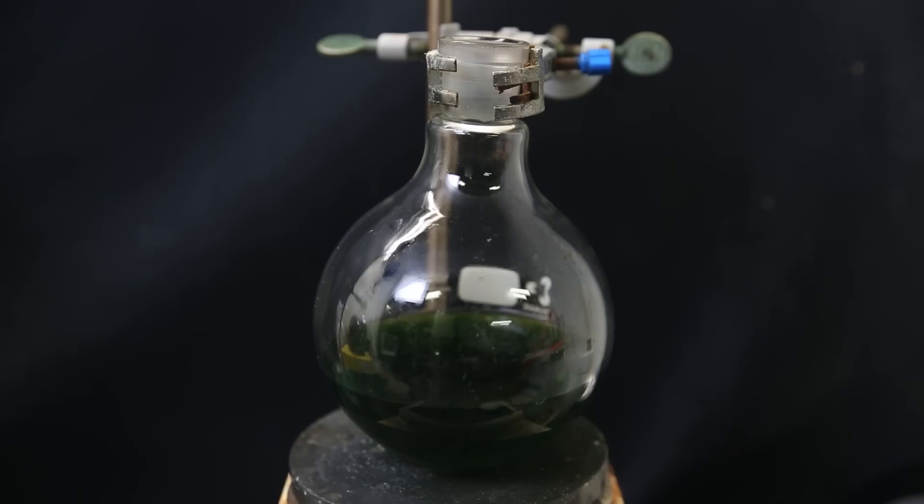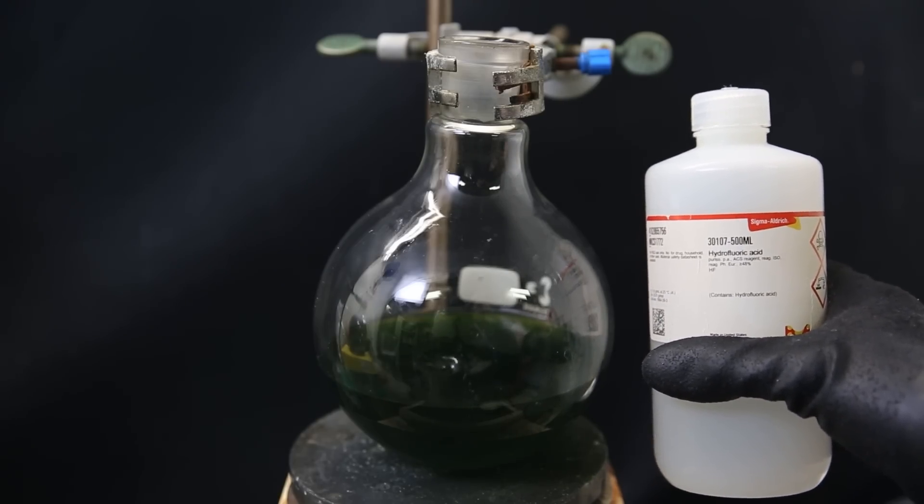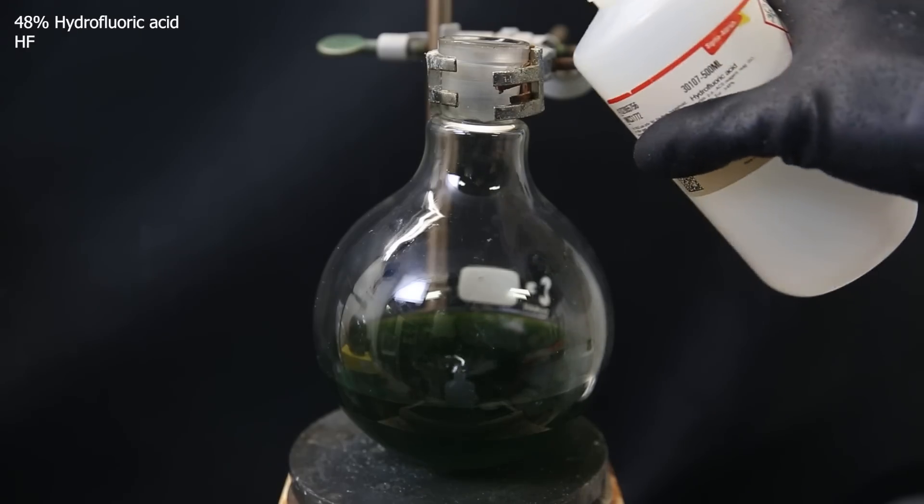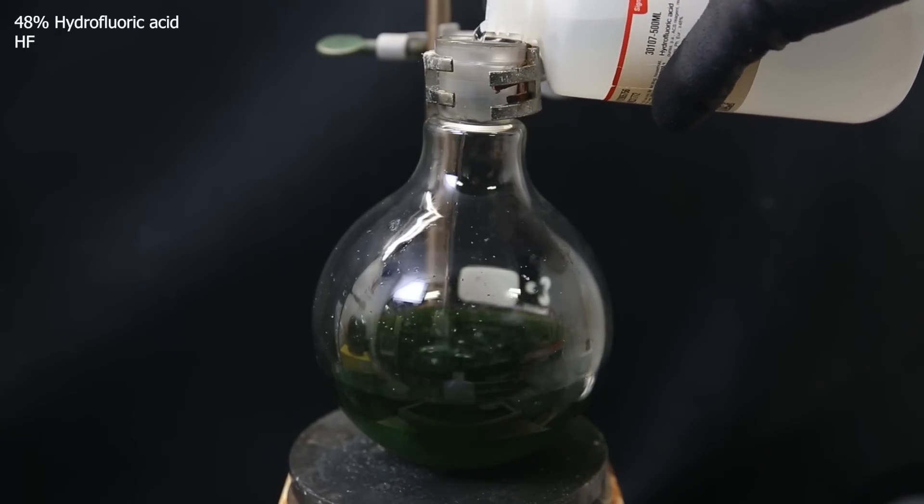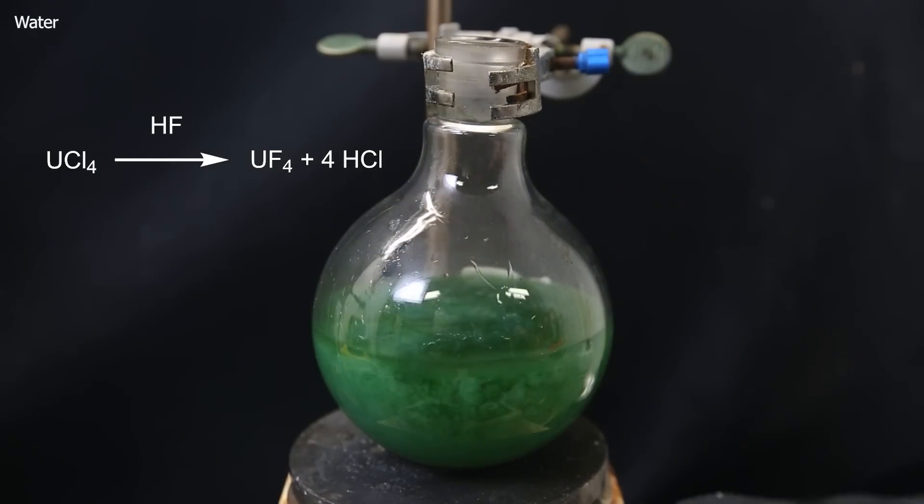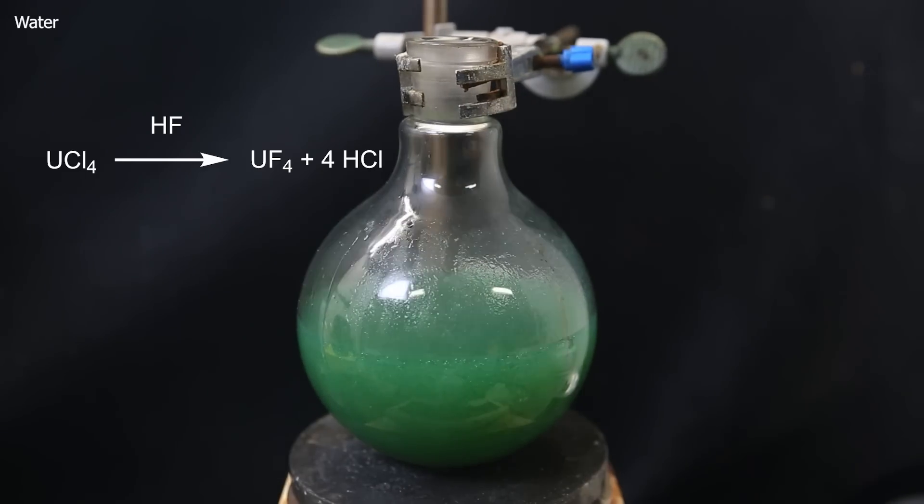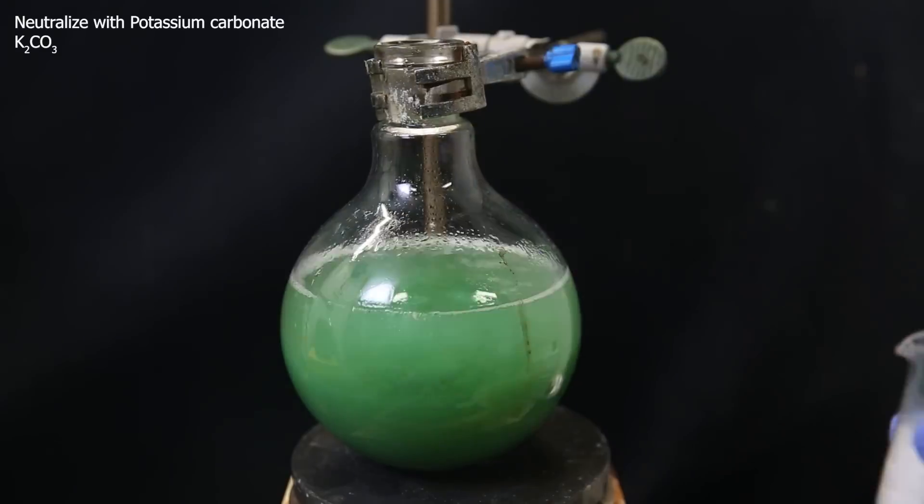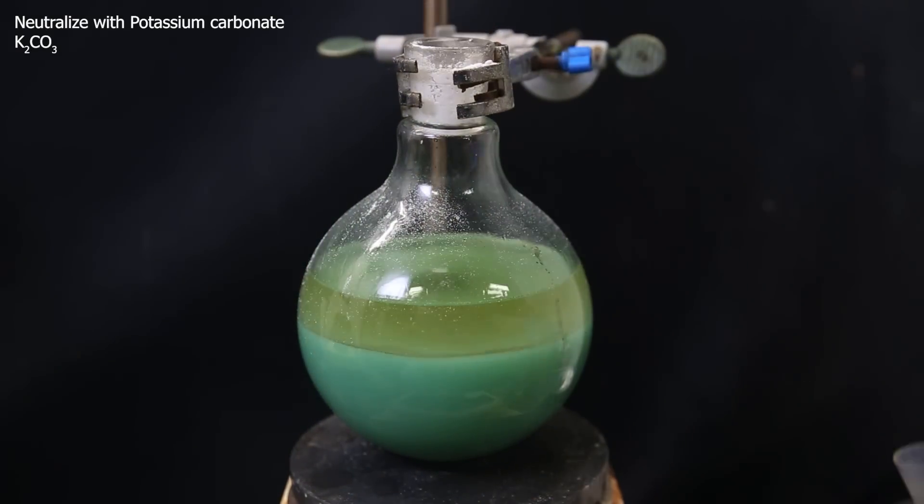Now that I have a solution containing uranium tetrachloride, I can convert it easily to uranium tetrafluoride. For that, I only need hydrofluoric acid. So to the solution, I add a random excess of 48% hydrofluoric acid. A solid precipitates, and I immediately add water to dilute it. All of the uranium tetrachloride immediately converts to uranium tetrafluoride, so I can destroy all the excess acid by adding the base potassium carbonate, until it stops bubbling from the addition.